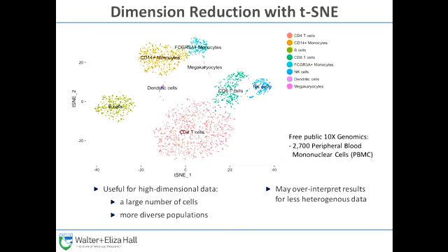To talk a little bit more about TSNE, because it's ubiquitous in the single-cell RNA-seq field now. For a time it felt like perhaps you were legally obliged to put a TSNE plot in every single-cell RNA-seq publication. They were that common. It works nicely when you have a large number of cells. So if you have 50 cells, TSNE typically won't give you a particularly appealing plot.